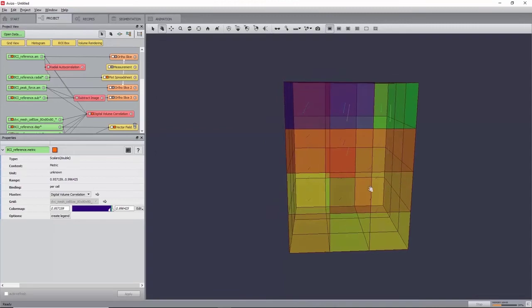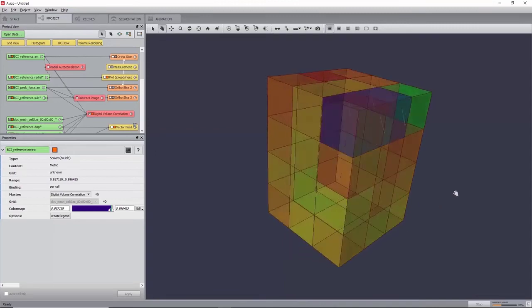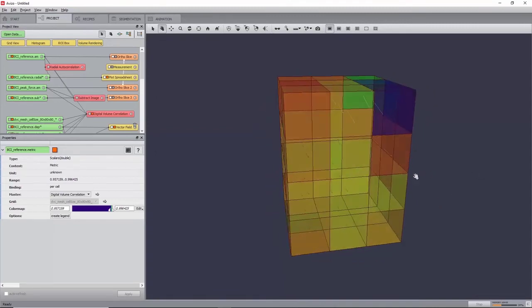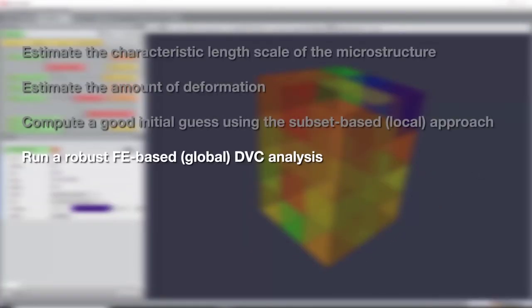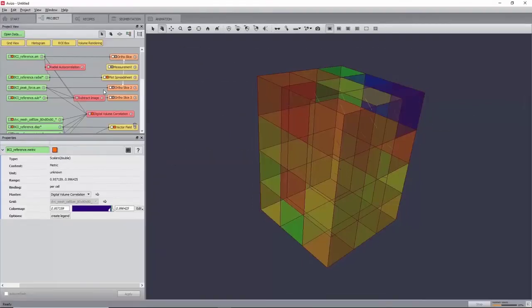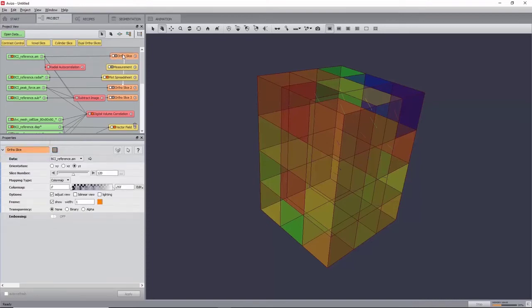Now that we have checked the quality of the displacement field computing using the local approach, it will now be used in order to initialize a finite element-based DVC algorithm using a finer mesh, also known as a global approach.